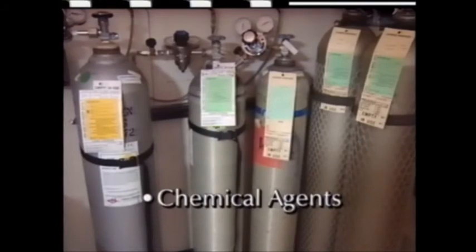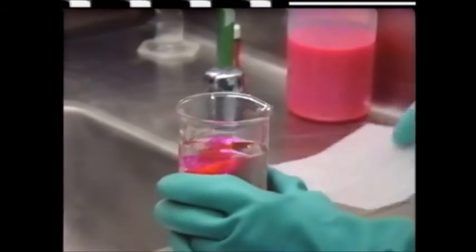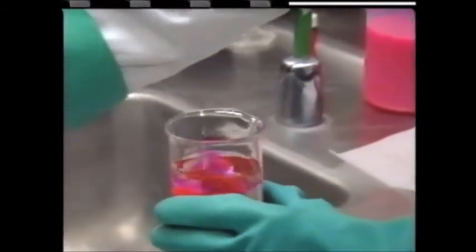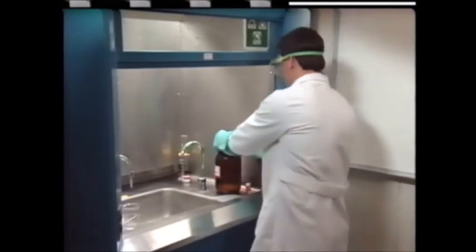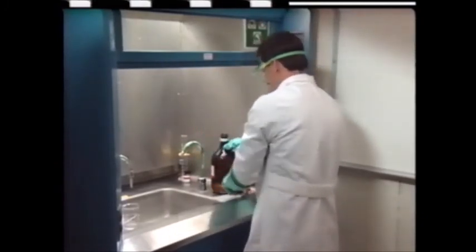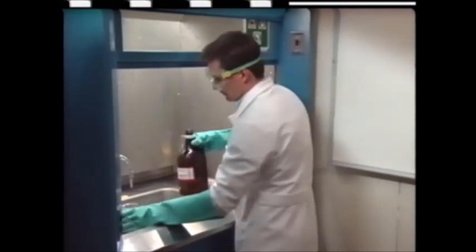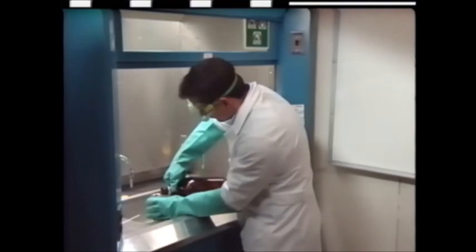When using chemical agents such as compressed gases, dyes, and solvents, you may be exposed to airborne contaminants and potential skin hazards. A good local exhaust ventilation system, such as an exhausted gas cabinet or a laboratory fume hood, will help reduce the potential for exposure to airborne contaminants. To help minimize exposure to chemical agents, you may need to wear personal protective equipment such as gloves and eyewear.